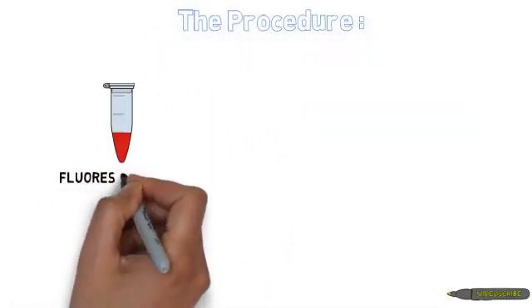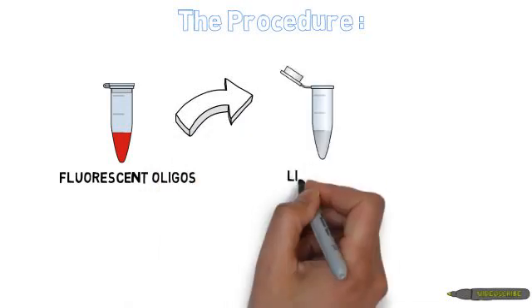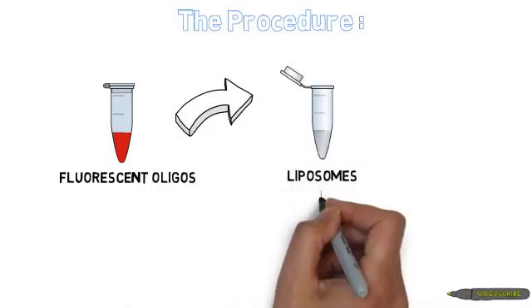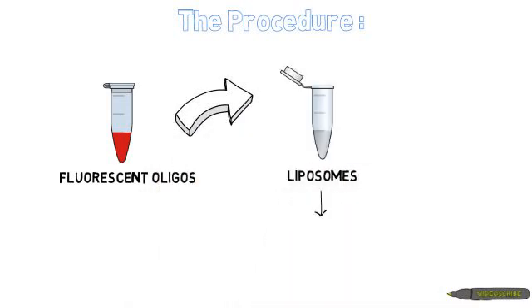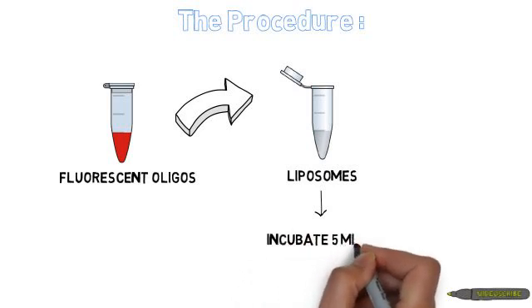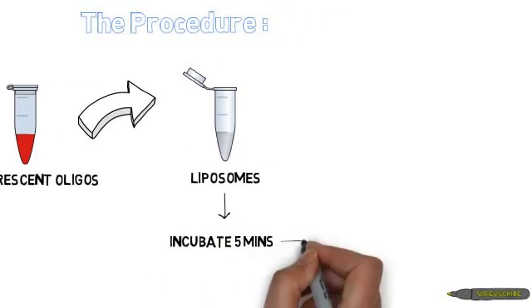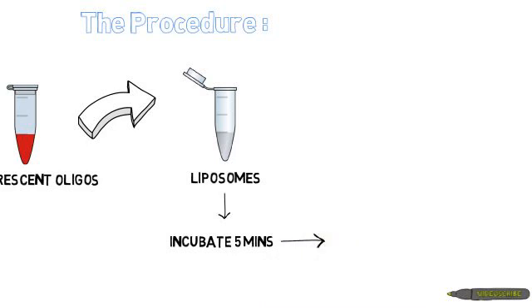Firstly, to prepare the glowing liposomes, I will mix an equal amount of the fluorescent oligos and the liposomes. Let this mixture incubate for 5 minutes to allow the oligos to go inside the liposomes.